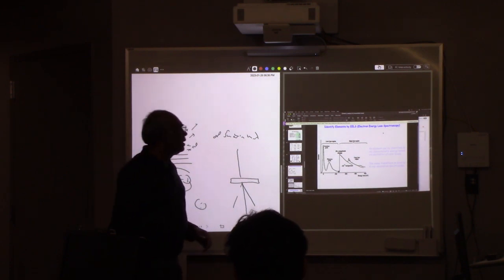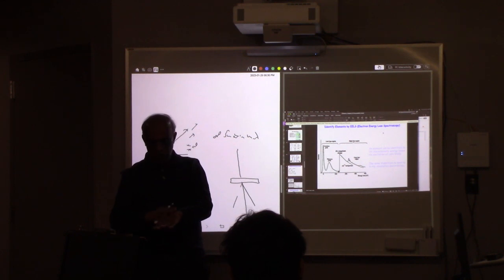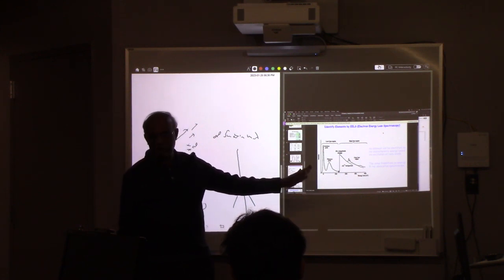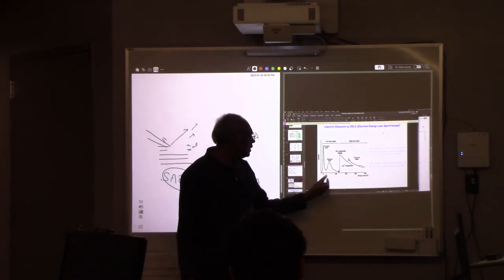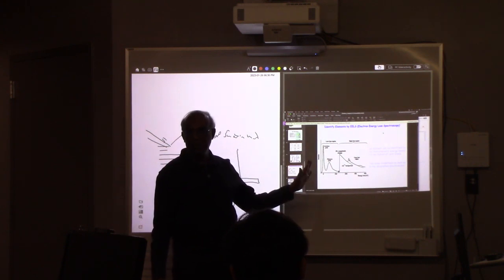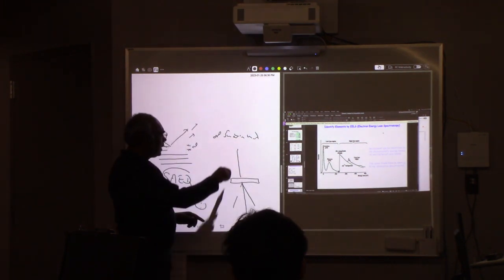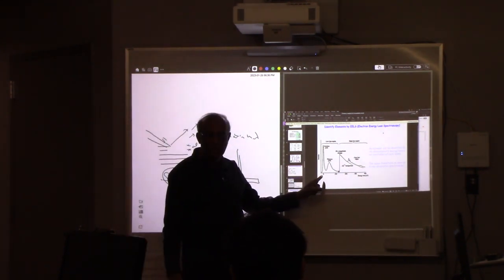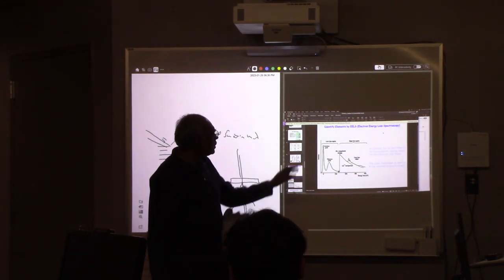So that's why a typical EELS spectrum, once you do your TEM image, then you do the diffraction, you can immediately do this. The only thing you need is the EELS detector, right? We have that one in our system. If you do that, you see the energy loss. Energy loss 0 means no loss, right? That's the elastic processes, either something that directly goes through or something elastically scattered. They all are counted here. That's the most intense peak, which we call the zero loss peak.